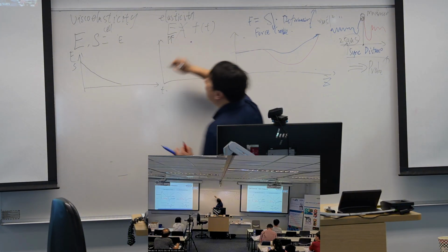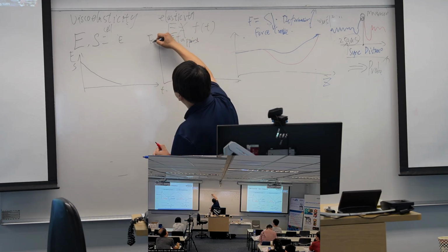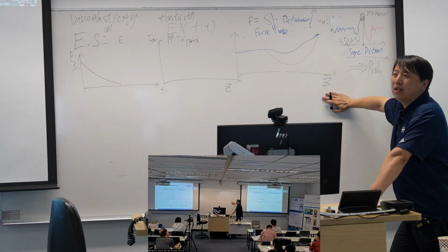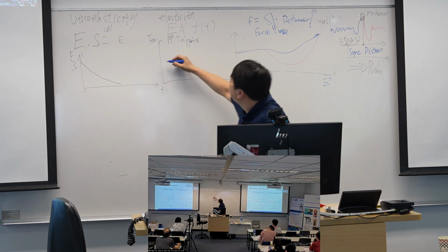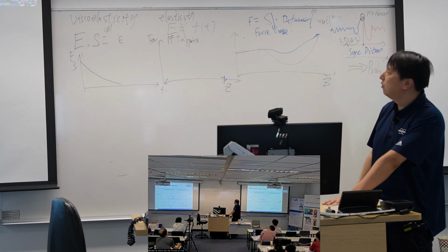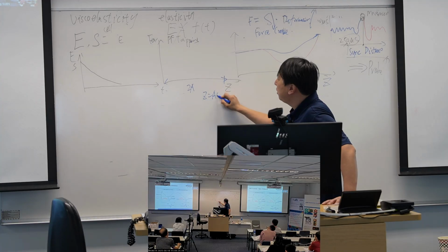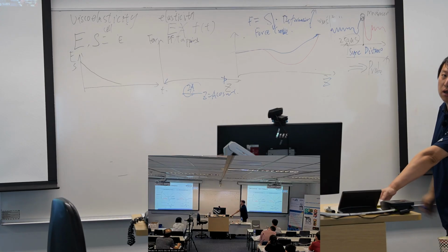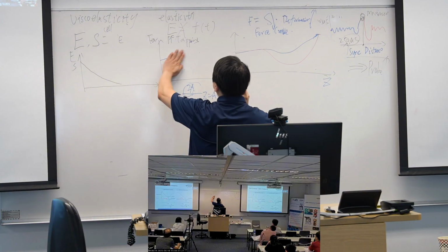In PeakForce Tapping, the logic, this is force, this is the Z, may not be the same as this one, because the distance we travel is a fixed value, right? The Z equals A cosine omega t. The distance we travel is a fixed value. So the probe will go and compress the sample.